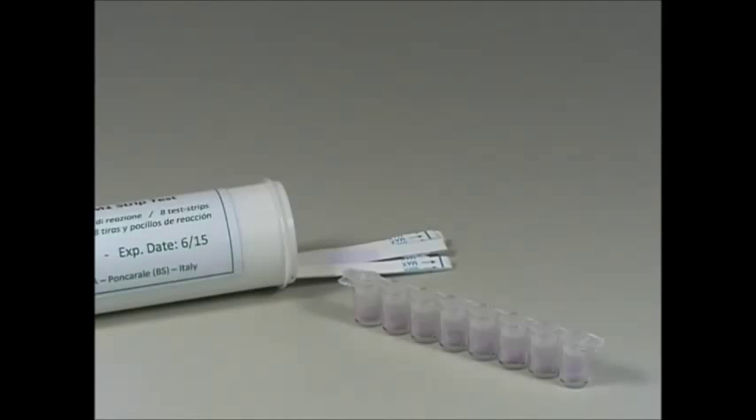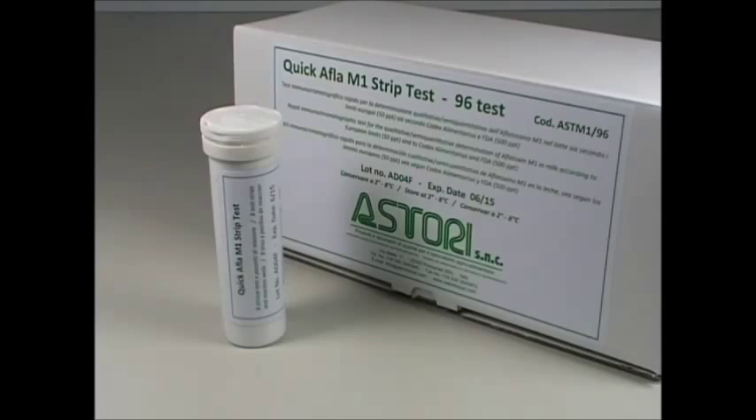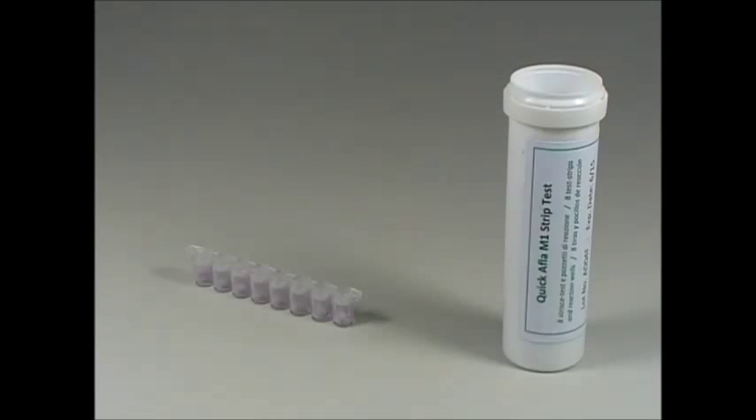Each cylindric tube includes 8 microwells and 8 strips. Take the kit out of the fridge. Before opening the tube containing the test strips, keep it at room temperature for 10 minutes at least.